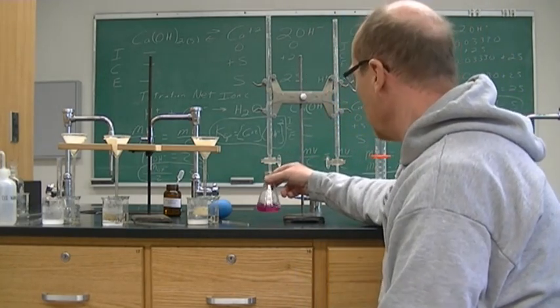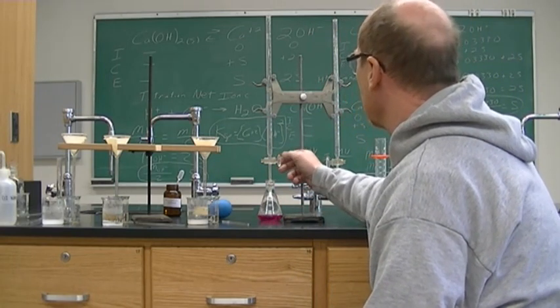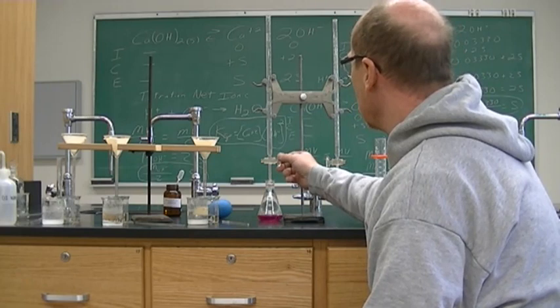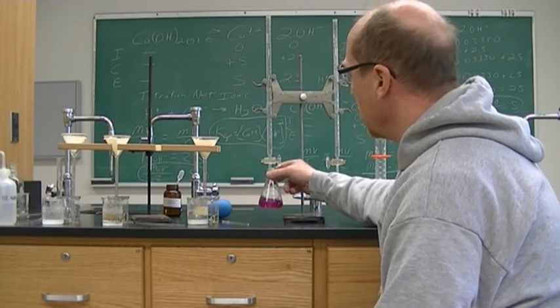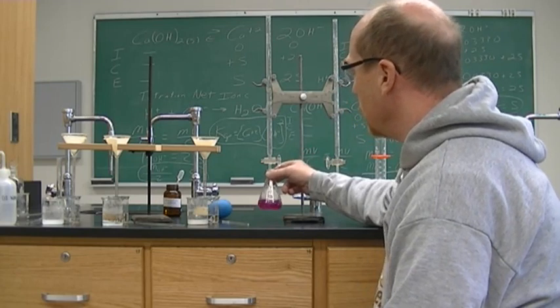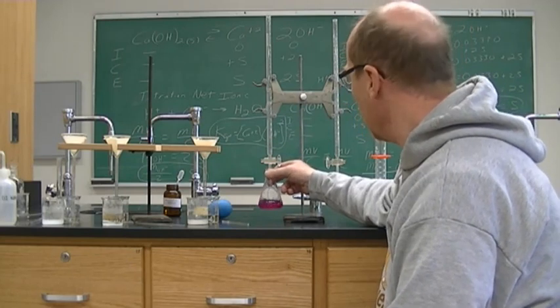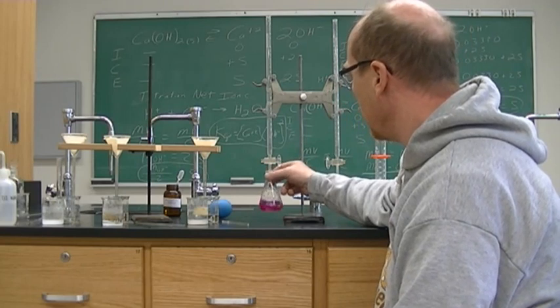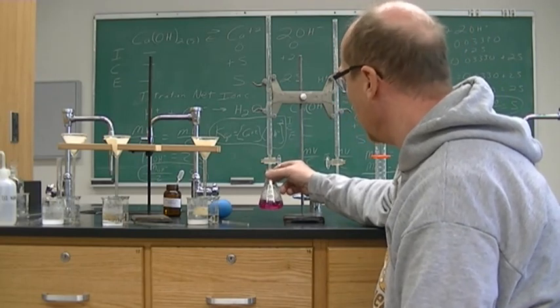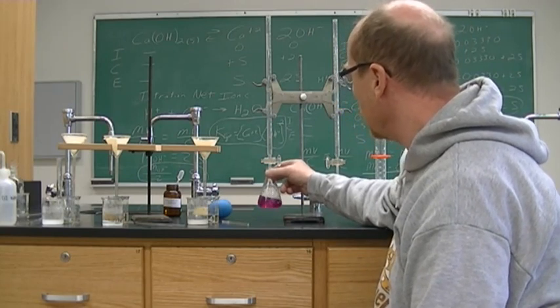Yeah, I forgot about my magnetic stir. All right, fine. I'm still swirling it myself. Maybe the next titration. All right, we're looking for 1 drop to go from this dark pink into a light pink. Actually, we don't want it to be gone. We want it to be a faint pink. And then 1 drop will turn it to light pink. Well, to colorless is what we want. 1 drop to go from a light pink to a colorless solution.